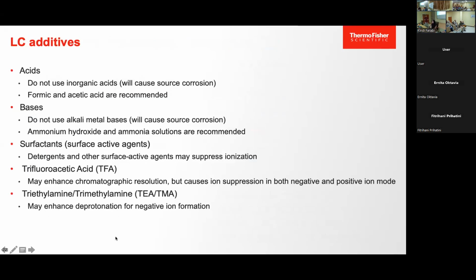When we are using a mass spec, it's not always the case that we get a good result and just carry on. We need to maintain the cleanliness of the mass spec because it will affect results. If I'm dealing with a very dirty sample, after I run it I need to do maintenance before I pass it on to the next user. Otherwise, she will always detect my compound.